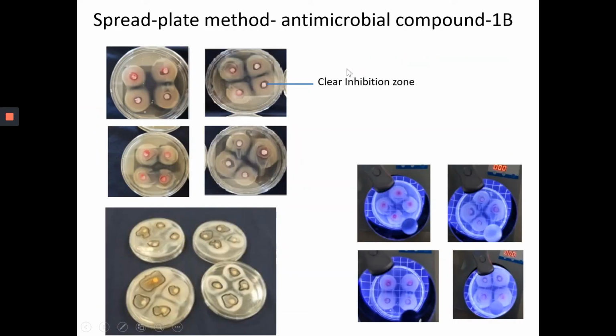So here is the one with the lead nitrate. Once you have this result, you measure the clear region with the longest diameter. What you can do is flip the plate and mark it from the bottom. It will be clearer to see at the edge, at the bottom of the plate. Then you use a marker to trace around it.